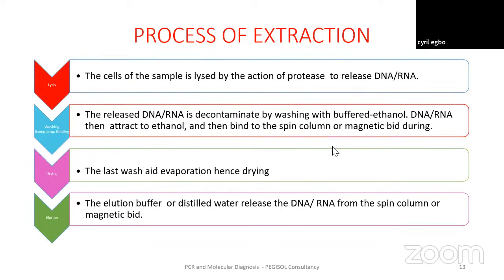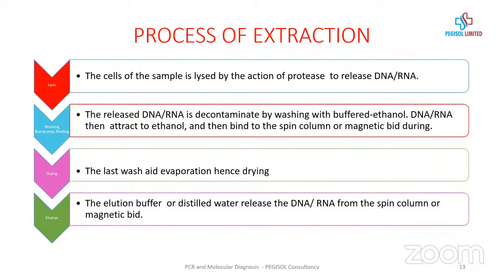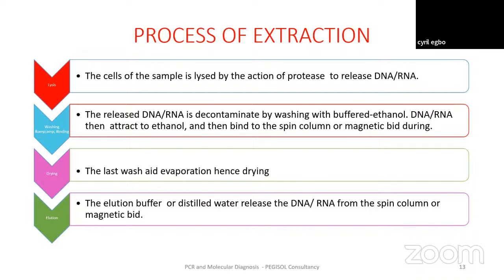Yes, okay. Like I was saying, the purification or extraction process follows this.